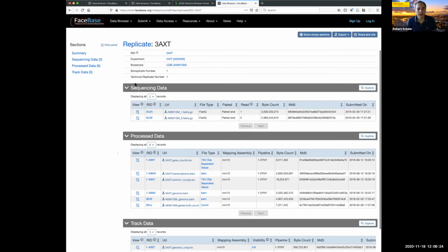Now, again, these files are large, 2.5 gigabytes, 2.3 gigabytes. So again, you're probably not going to download from here. I will just point out that these are downloadable links. So in some cases with, say, a smaller data size, you might just grab them directly from here. So if I follow this link, I'm going to get a download dialog. Hopefully you see that. I don't know if Zoom captures that, but that's what I'm looking at.